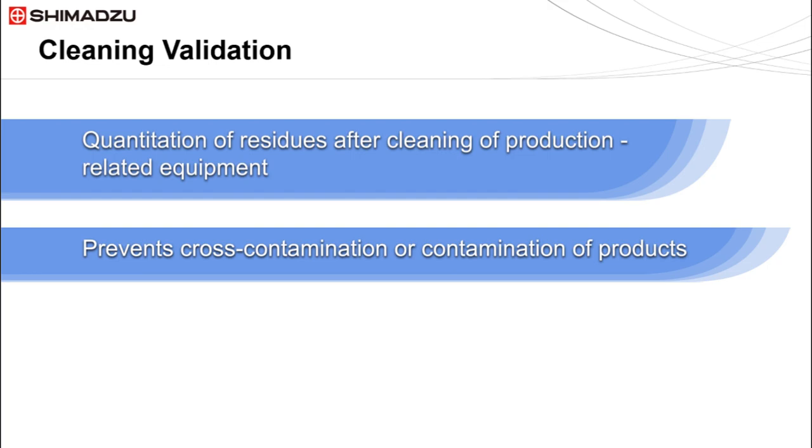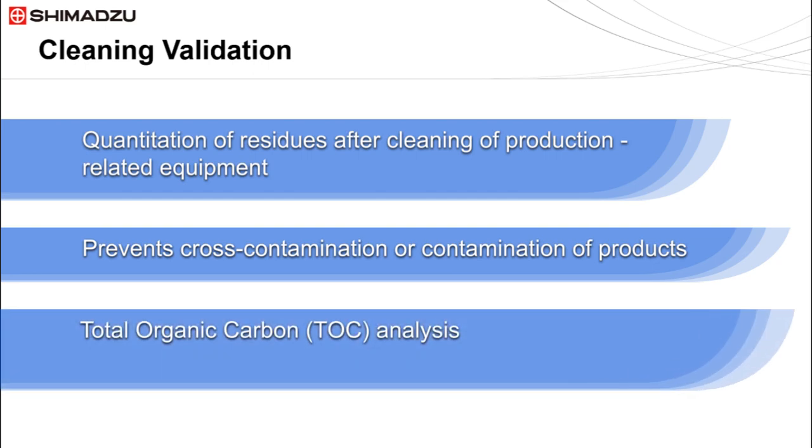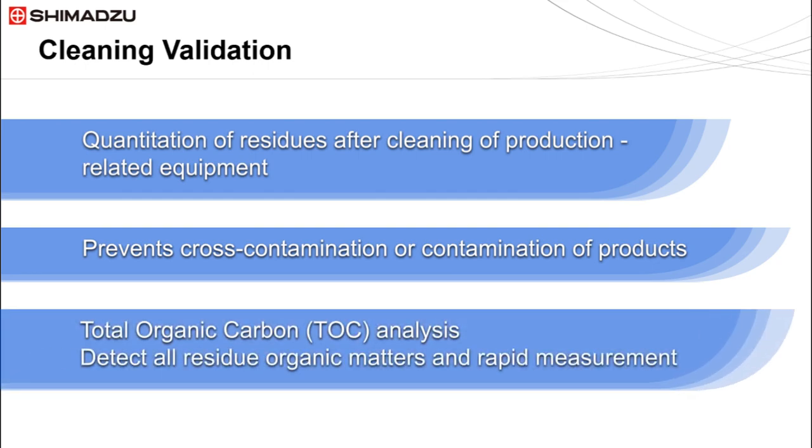There are various analytical methods for cleaning validation, and one of them is total organic carbon, or TOC analysis. Some of the features of TOC analysis are its ability to detect all residue organic matters, and it is considered one of the faster measurement to obtain results.